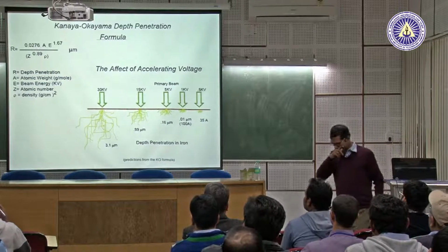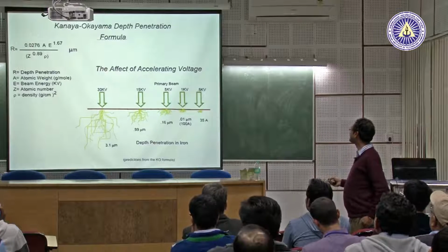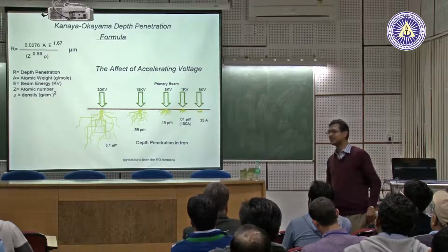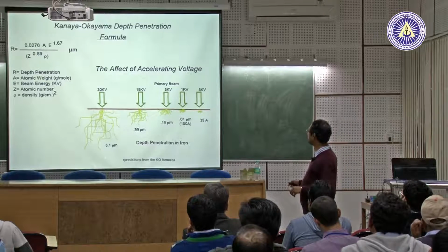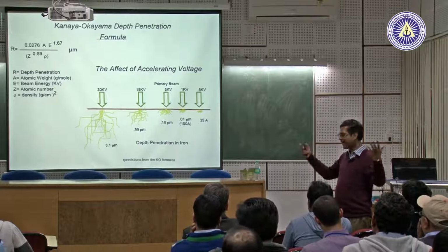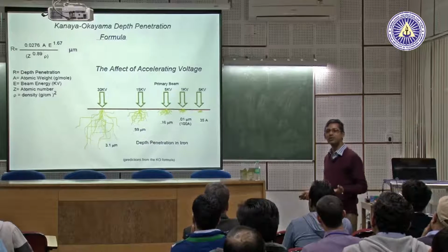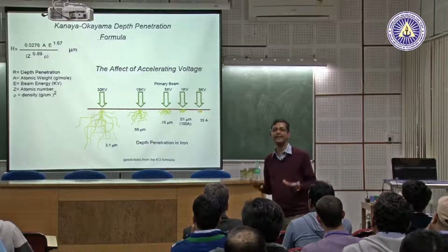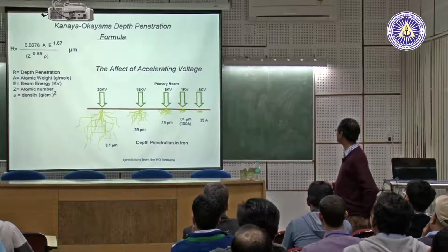Yeah, now comes the real aspects of that. This is very important. Why? Because we are probing with electrons. So you bombard electrons, the electrons will go inside the material and create an interaction volume. How big is the interaction volume? That will tell you from where you are getting the data, the information. And this is something students always make mistakes with.